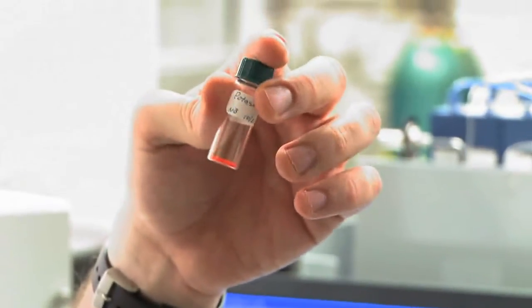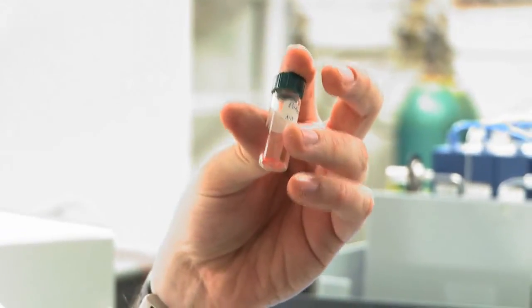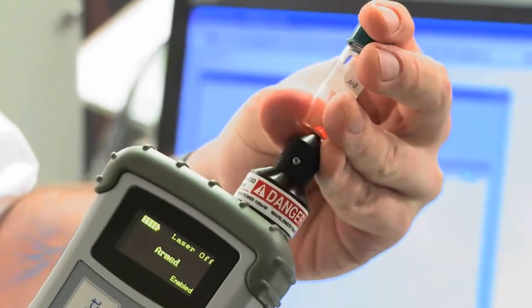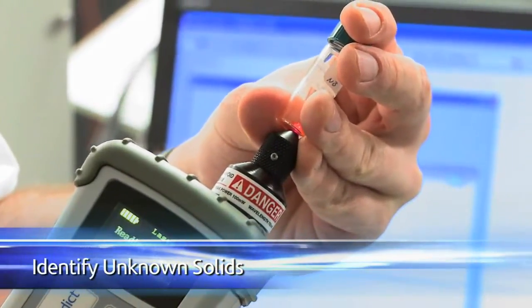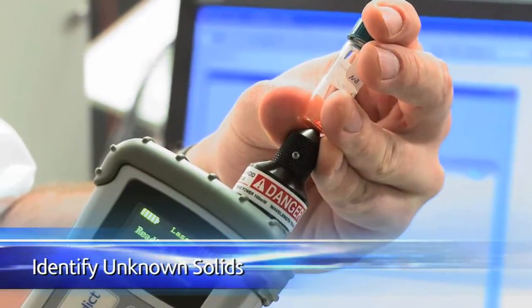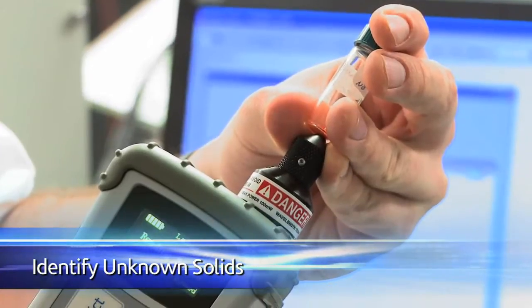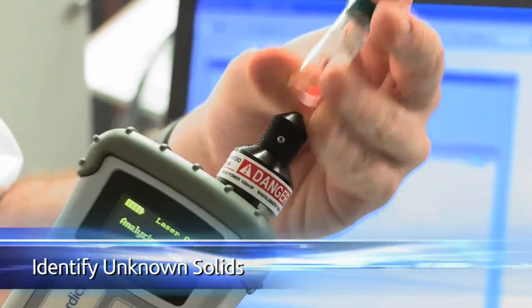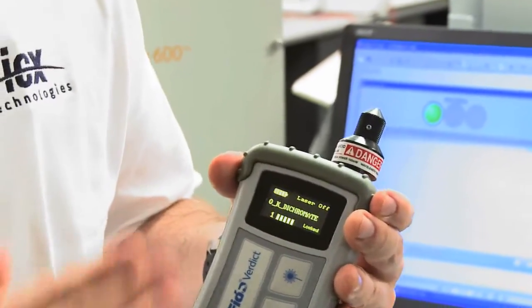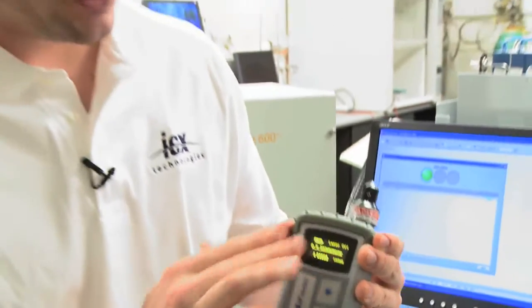Here we have potassium dichromate, an orange oxidizing substance which is often found in fireworks and potentially in homemade explosives. We have the tip down for the glass vial, and we follow the exact same procedure as before. So we can arm, reading sample, laser on, reading sample, laser off, and analysis. Again, Fido Verdict has targeted libraries, so we're focused on explosives and narcotics. It returns oxidizer, K for potassium dichromate, 5-bar match. So we've accomplished exactly what we were looking for.